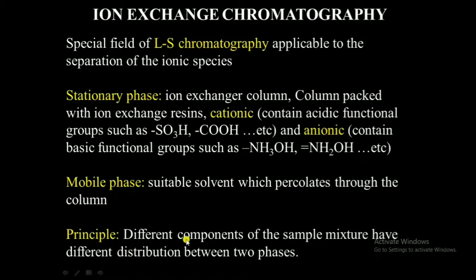The principle, which is the general principle of any chromatography technique, is that the different components of the sample mixture, here for example the ions, have different distribution between the two phases. So how is this different distribution coming? Because the ion exchange capacity of ions varies.